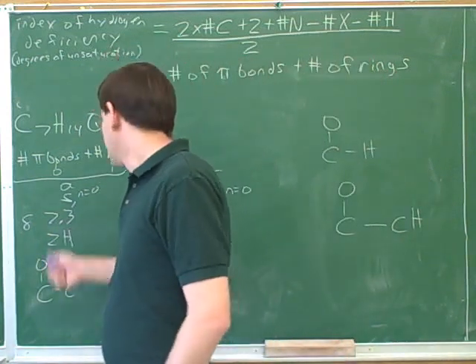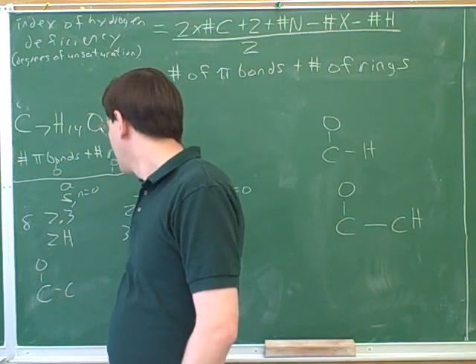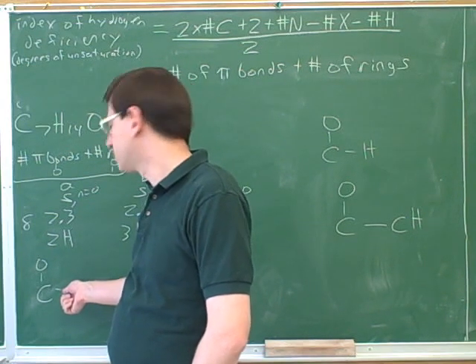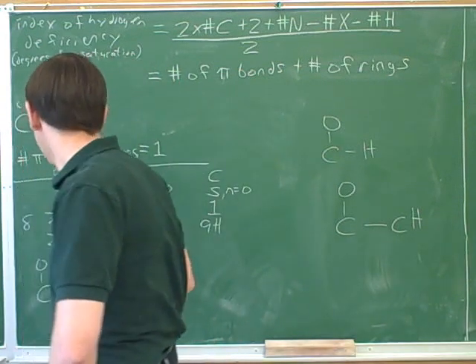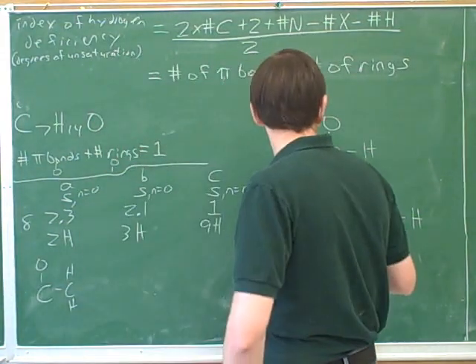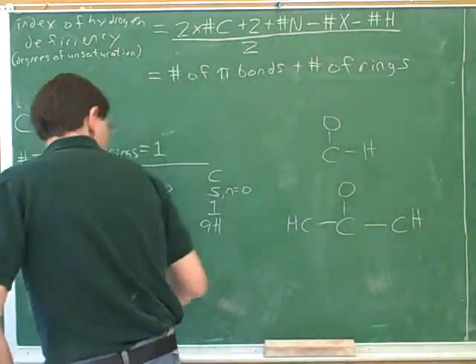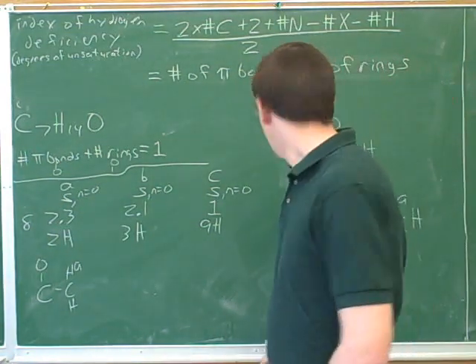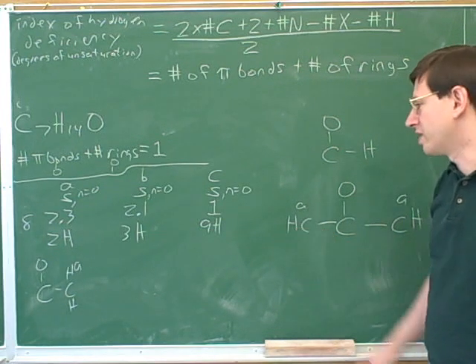We were working on this fragment here, and it looks like these hydrogens can't be on this carbon, but they can be on this carbon. Correct. And how many hydrogens does it look like there are on this carbon? 2, because this has an integration of 2. That's only a guess, because it's possible that it could be one hydrogen on the left and one hydrogen on the right. Another possibility is that it could look like this. We could have one group A on the right and one group A on the left. Although then we'd have to have a lot of extra bonds on these carbons. It might be hard to fill these up with enough bonds if there can only be one hydrogen in each place.